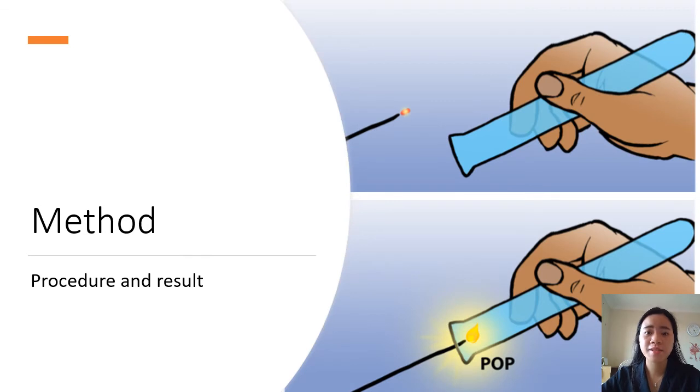To test the presence of hydrogen gas, we put a lit match at the large test tube neck. The flame burned stronger and the pop sound appeared. Hydrogen gas is highly flammable and exposure to flame produces a pop sound as the reaction of hydrogen with oxygen in the air causes a small explosion.